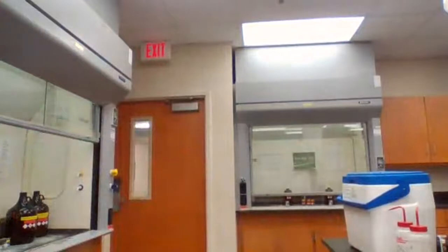You have your lab manual that you purchased from VitalSource, and in experiment part A, it says using a test tube. So I'm just going to get my test tubes here.